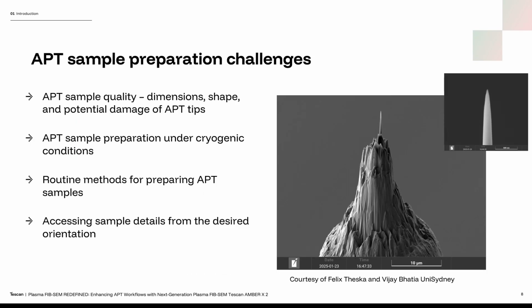Let's dive deeper into atom probe sample preparation. So let's start with the challenges. The first challenge is the overall quality. It could be dimensions, the shape, and also the potential damage to the atom probe tips. There is also demand to prepare such samples at cryogenic conditions for beam-sensitive materials. Also, one of the challenges is to make the atom probe sample preparation more routine or even automated.